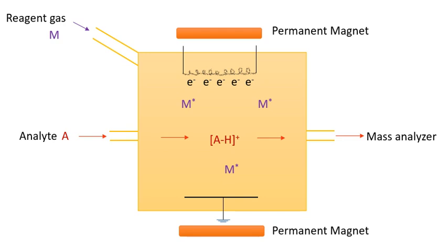Chemical ionization can also be used to identify and quantify an analyte present in a sample, by coupling chromatographic separation techniques to CI, such as gas chromatography (GC), high-performance liquid chromatography (HPLC), and capillary electrophoresis (CE). This allows selective ionization of an analyte from a mixture of compounds, where accurate and precise results can be obtained.